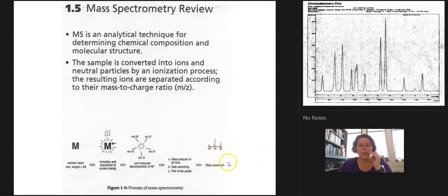And so you'll get this mass spec, and you compare it to a library, and it'll tell you there's a 95% chance this matches up with benzene, or whatever compound you're looking for. When I first started doing mass specs, we used to have these giant books that we'd have to match our chromatograms with to identify compounds. Now it's all done on the computer. It identifies it for you. You can identify the compound based upon how it is broken up inside the mass spectrometer.